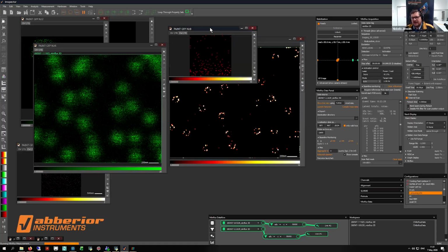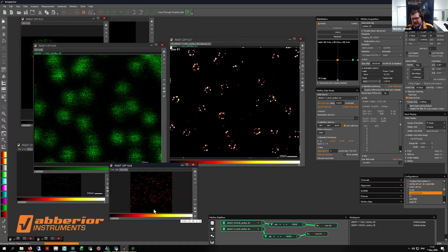The measurement is still running. You still see blinking, some events, and sometimes localizations. And you also see the iteration count that we have in the different localizations. We localized now 600 positions, and every position is imaged several times, so more than 12,000 localizations are gathered already.